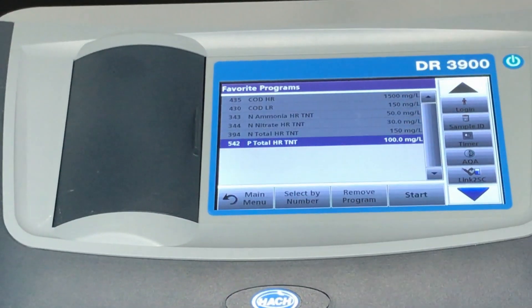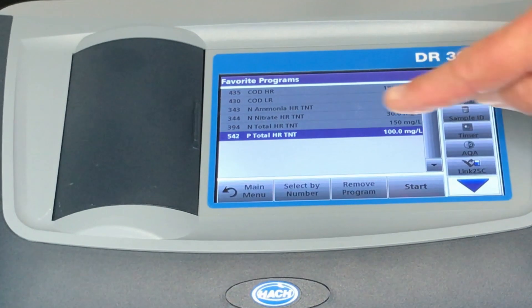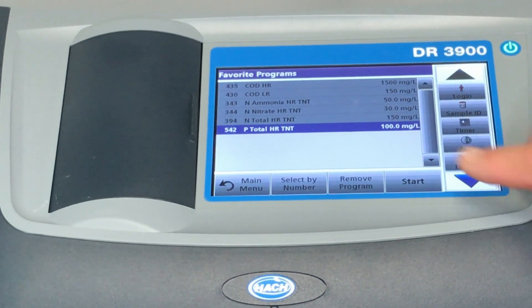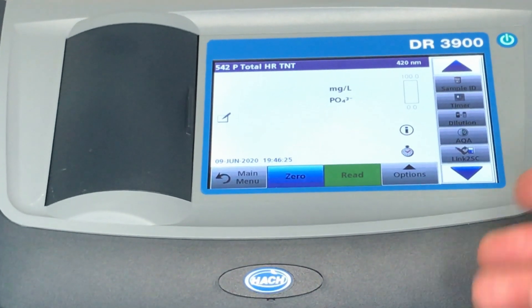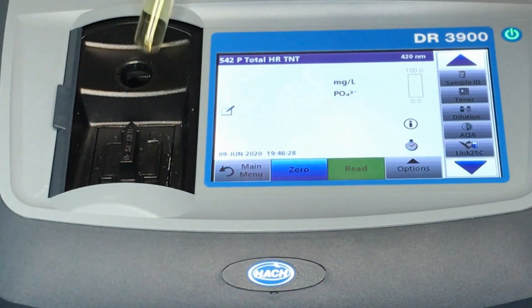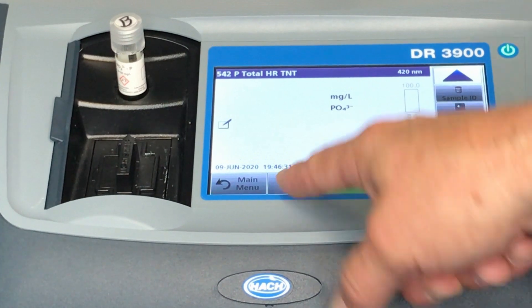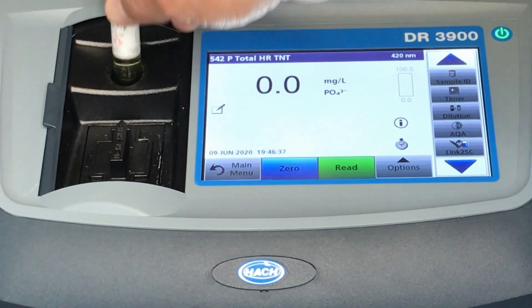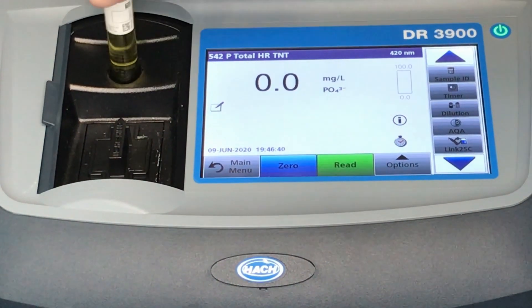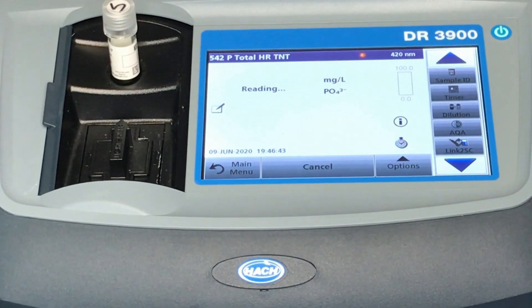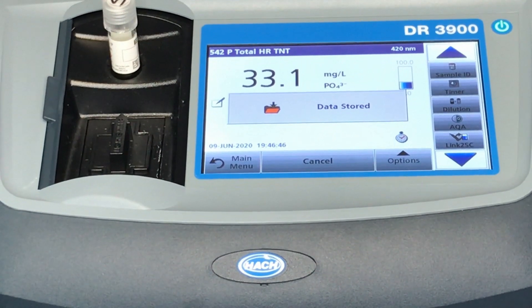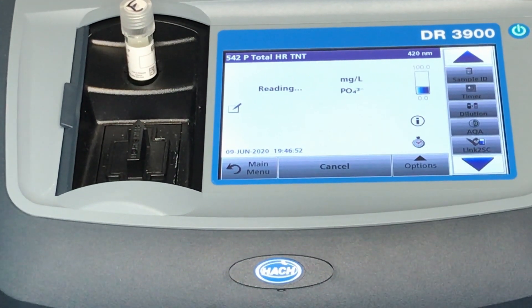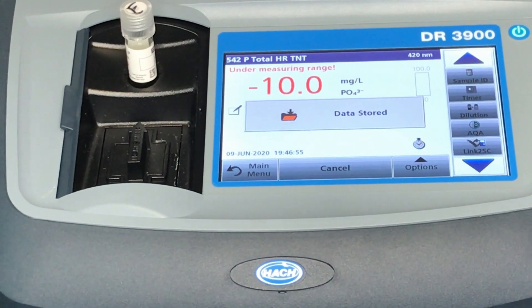On the Hach spectrophotometer 3900, choose method 542, Total Phosphorus HR TNT, and press start. Place the vial marked blank in the spectrophotometer and press zero. Repeat with the other vials, pressing read. Record results in parts per million on the bench sheet.